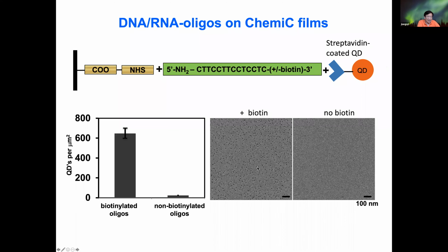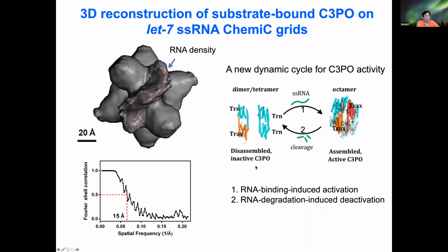As you can see, it's also a day-night difference. Our grid shows a dramatic enrichment of the loaded sample at low concentration, and this can also be used for three-dimensional reconstruction. Shown here is an example. We can put a 240 kilodalton protein onto our RNA-presenting grid.